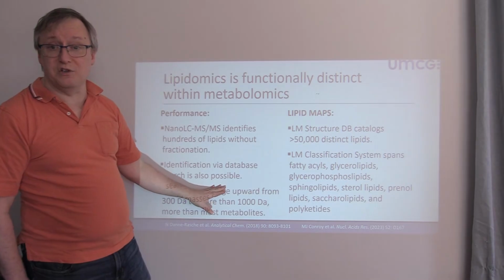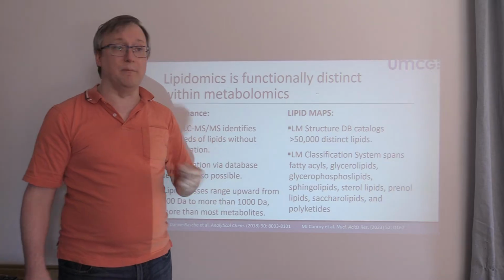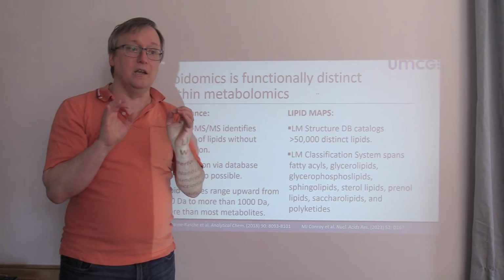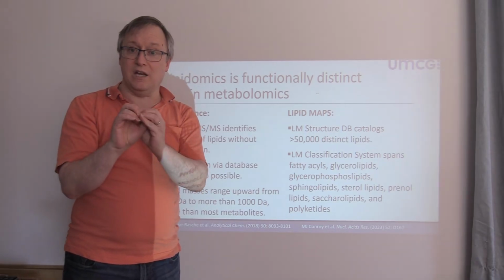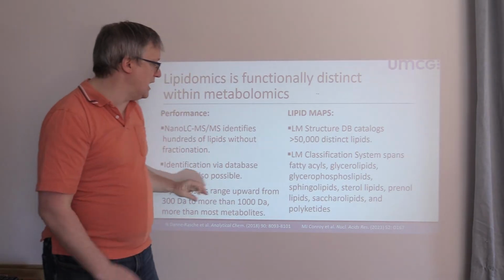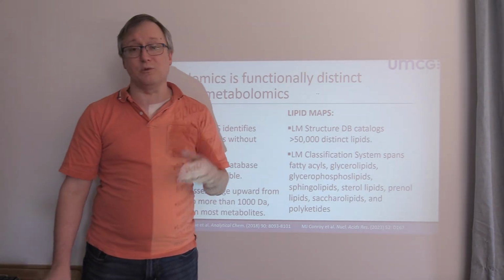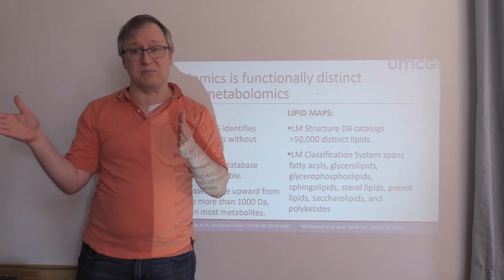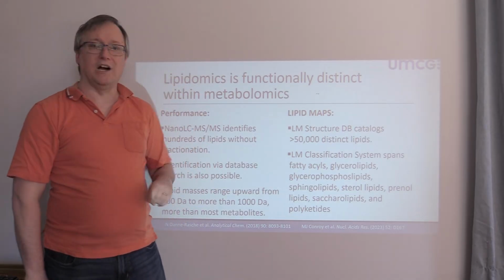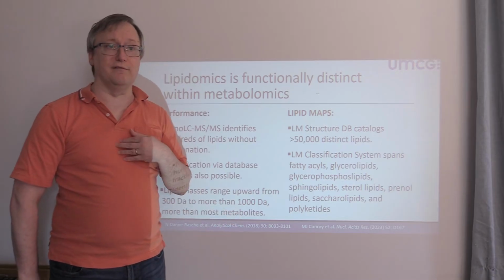It is also possible to use strategies like database search for identifying these phospholipids. There are really good models that explain what fragment ions you should expect to see in positive ion mode or negative ion mode, typically negative ion mode in lipid mass spec, to say which fragments we expect if it were this particular lipid. So some of the techniques we know from database searching of peptides have parallels as we move over into the metabolomic space.